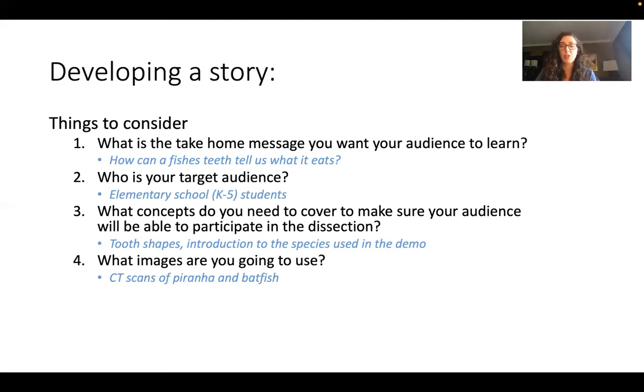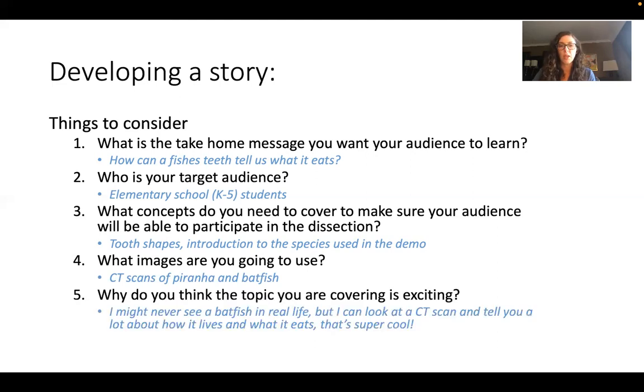And then I like to use a CT scan of a batfish, which is just a bizarre looking fish that most people have never seen or even heard of. And even if they have, they've definitely never thought about what they eat. So it's a really fun activity to incorporate a foundation of what the participants do know and build off of that to learn something deeper about these different animals.